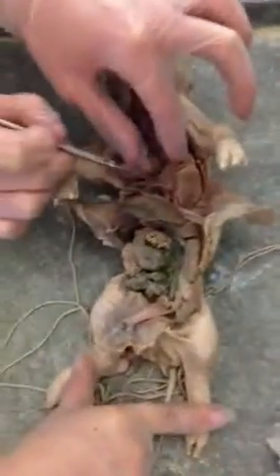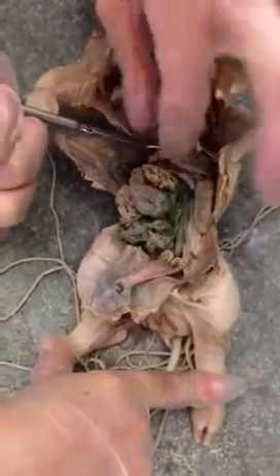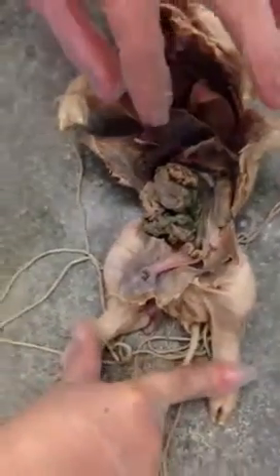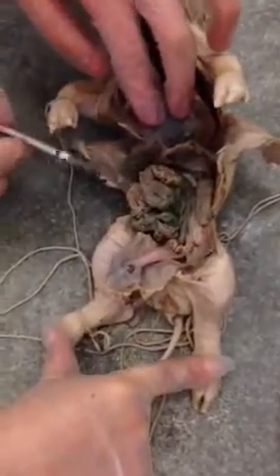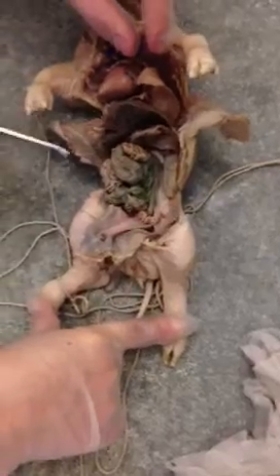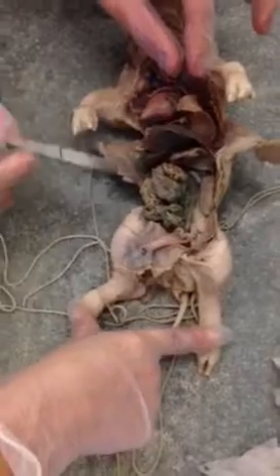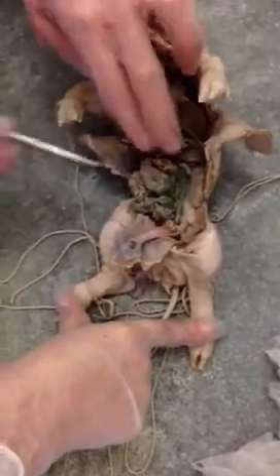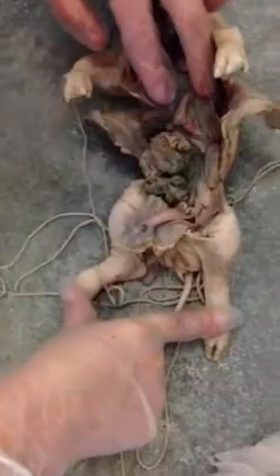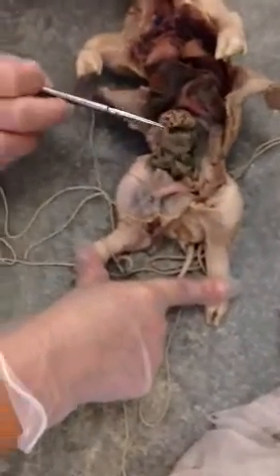Okay, so from the esophagus we go all the way down to the stomach, which is right here, this structure. From the stomach we go to the small intestine, which again we pointed out. From the small intestine to the liver. No, liver is an accessory organ. Yeah, I'm just looking at the paper, it just has it all bunched up. So anyway, here's the liver. Gallbladder, we already went through these features. The pancreas, again, down here. To the large intestine, which contains the cecum.